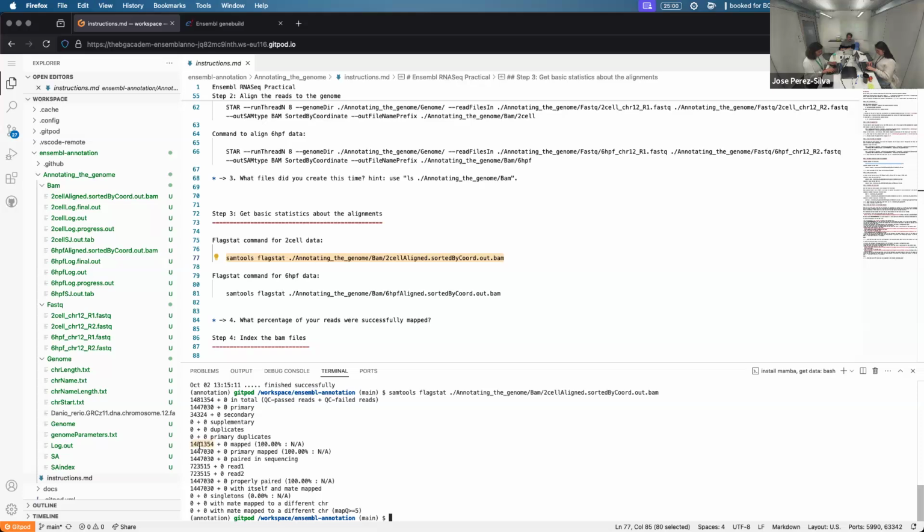stats. Specifically, you can see that 100% of our reads were mapped, which is a very good thing. You can get an estimation of the number of reads per file. Again, a very reassuring 100% properly paired. So essentially, all of this looks great, so we can move on. Just so that you can check again how quickly this is, the second pair, the second BAM, again looks quite nice. 100% aligned, all properly paired, and so on.